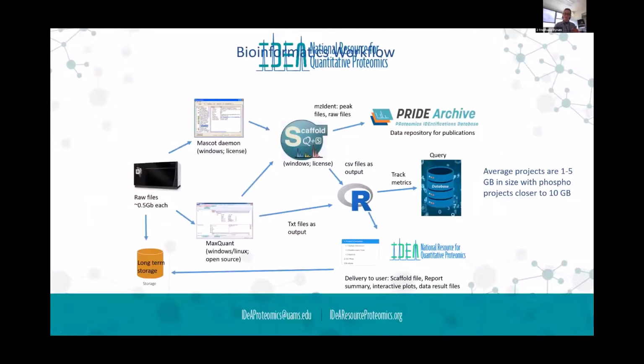Okay, so this is just kind of an architecture of the workflow of how things are working. We're currently working with Google to develop some of this stuff in the cloud, which I hope will be a nice resource for all of you to use later. Just to let you know that is coming.